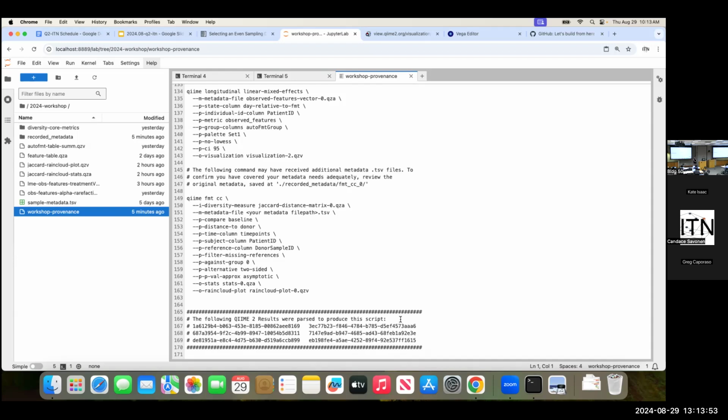And we use those internally to connect results up with the commands that called them. So it's how we refer internally to these. This isn't ever information that you need, but it does come in handy sometimes.